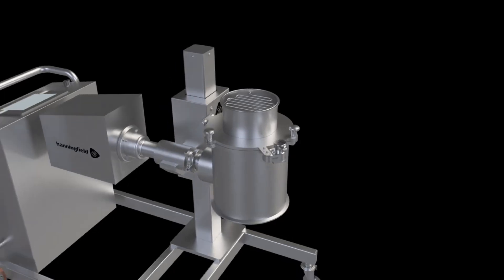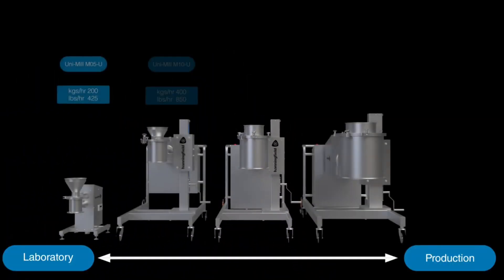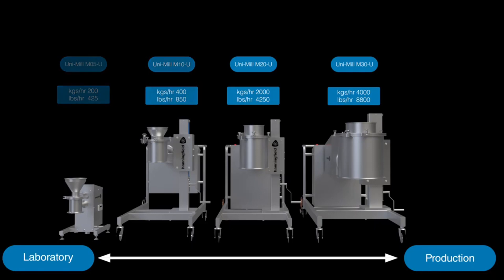The Unimill is available in various sizes to satisfy a wide range of applications from small-scale laboratory through to high-capacity production. Importantly, a consistent tip speed means results are scalable between each size of machine.